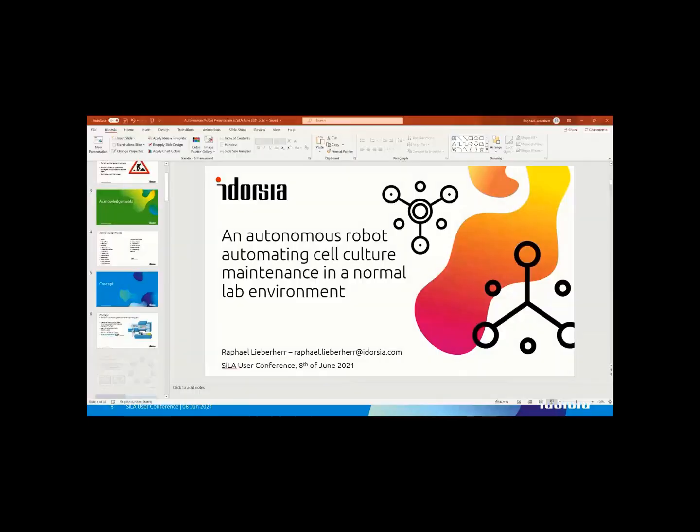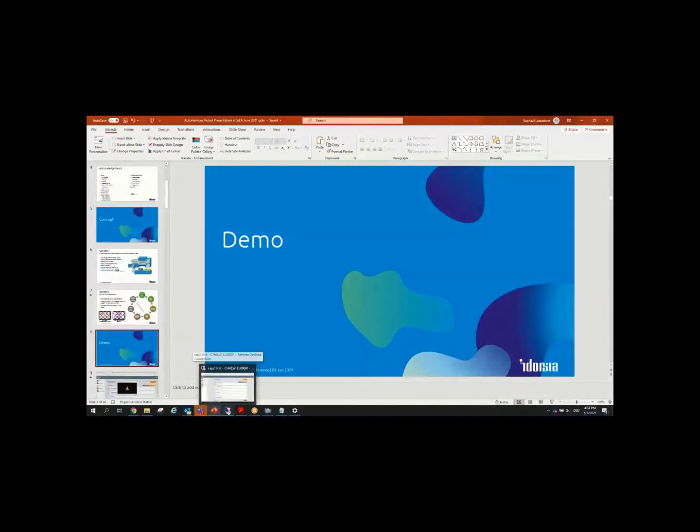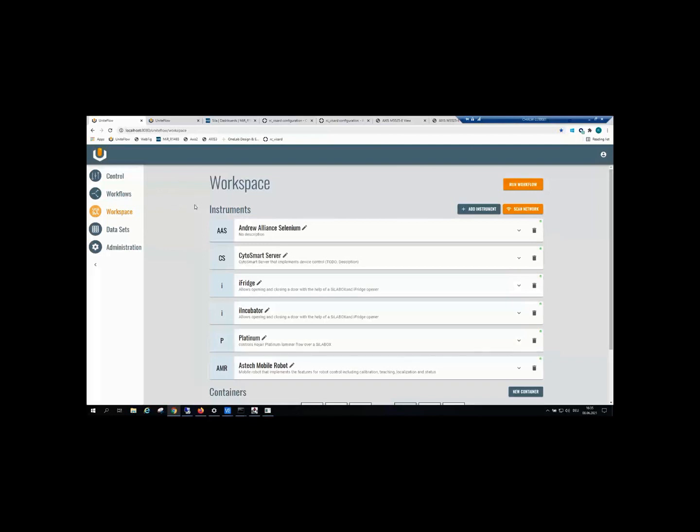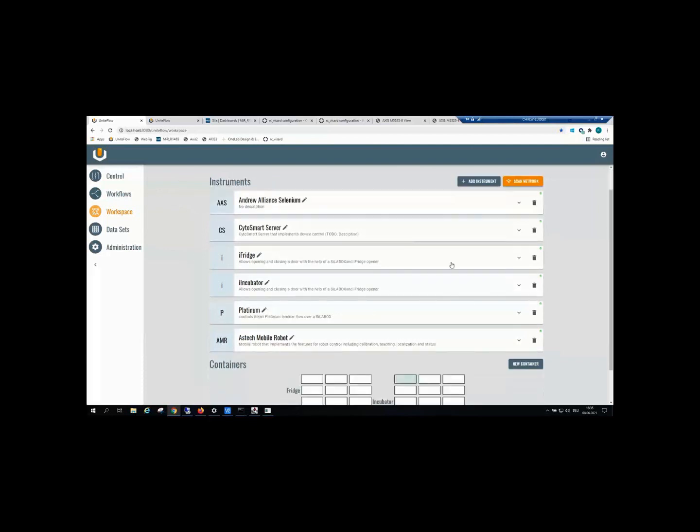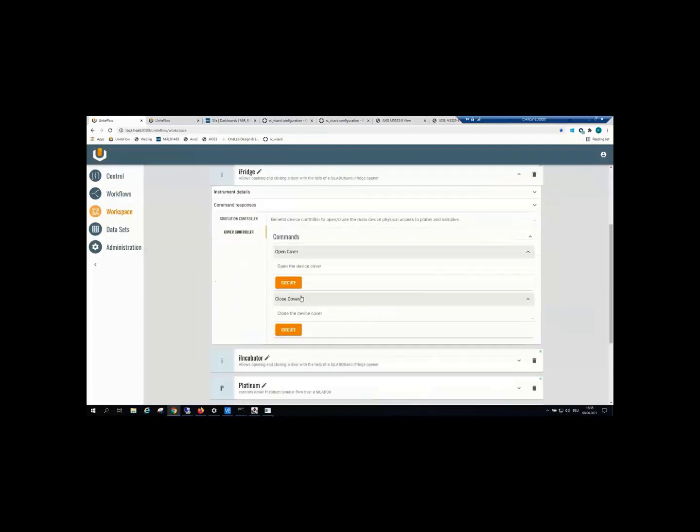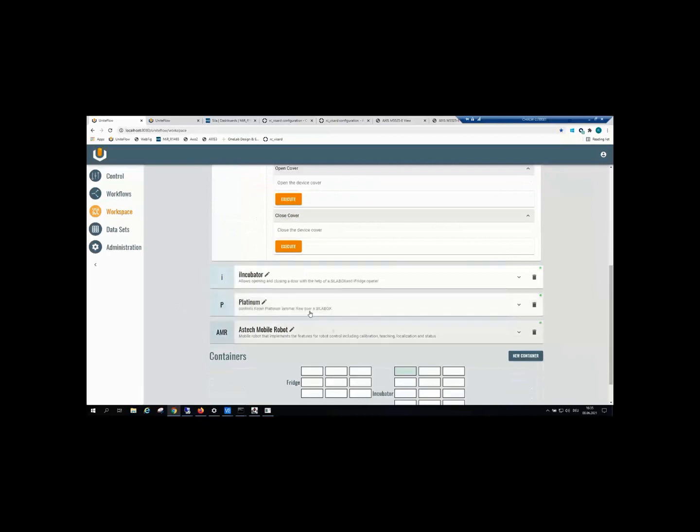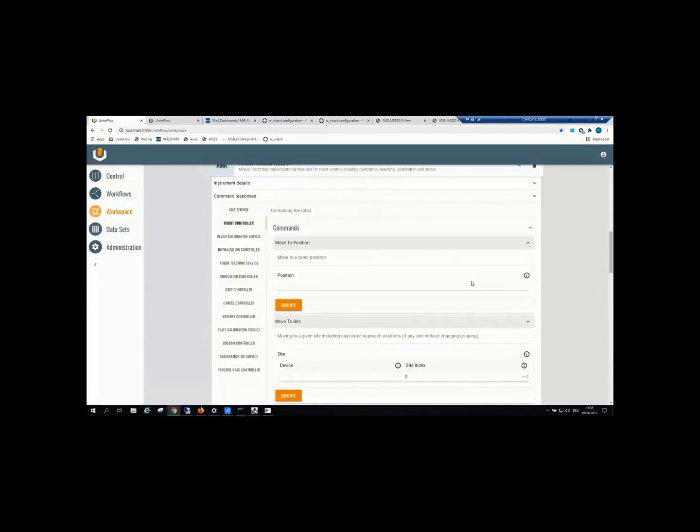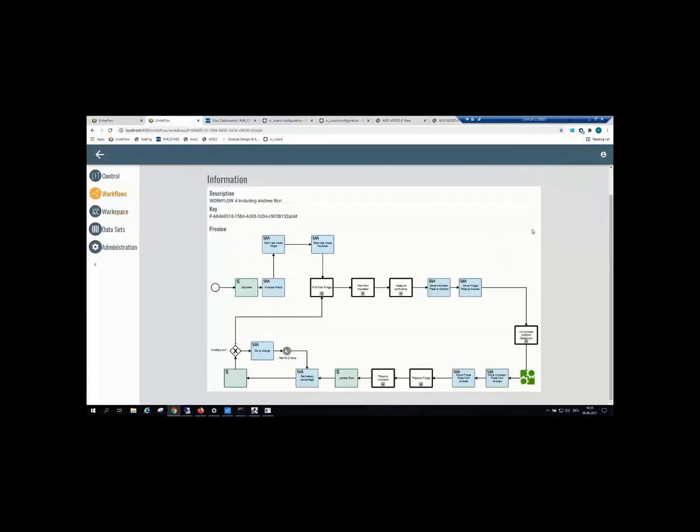That brings us to the live demo. You've seen something similar presented last year as a movie. We kept working on it, made it more stable, improved things, added more devices, so we thought we'd do a live demo. This is all hosted on a PC here. You can access it from everywhere within the corporate network. You have a workspace showing basic functionality of the fridge where you can open and close the door. Other devices like the robot are more complex, featuring more commands. You describe the workflow in a BPMN fashion.